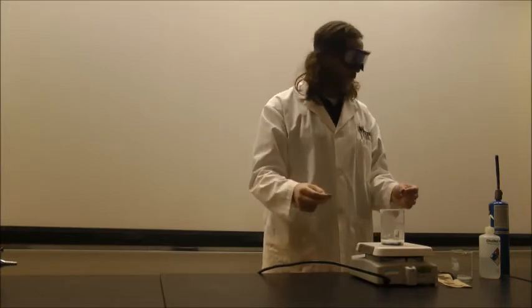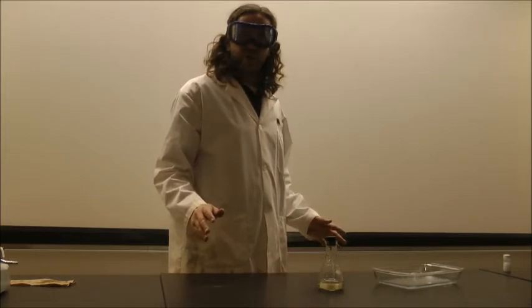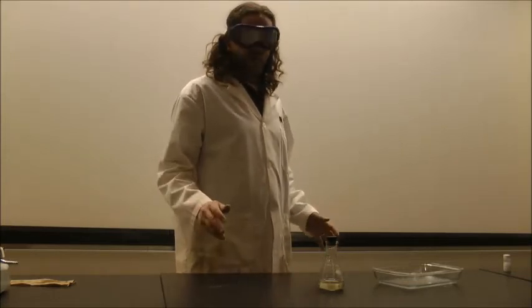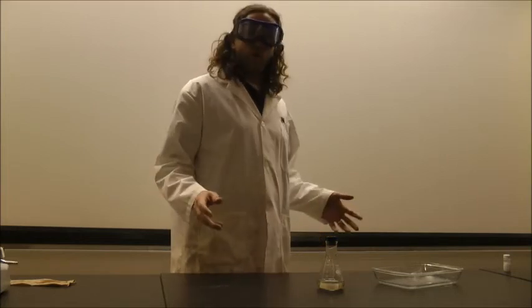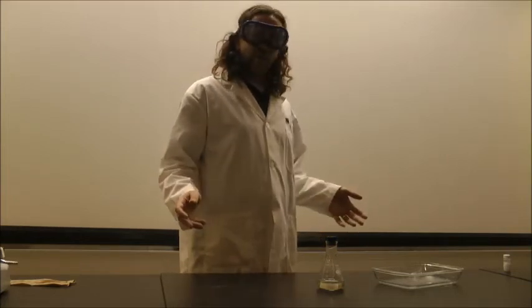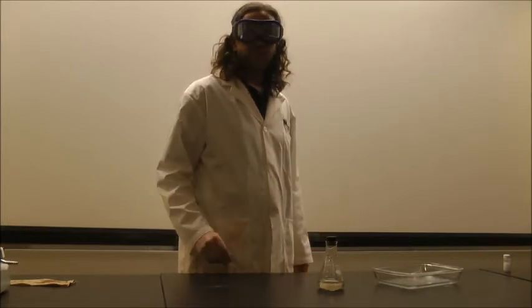We here in the Missouri Western Chemistry Department love doing demonstrations, and one of our favorite days of the year is Super Science Saturday. And what would a Super Science Saturday demonstration be without a demonstration of supersaturation?